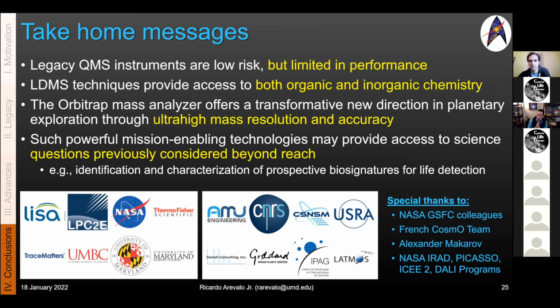The second one is, is the Orbitrap just like the commercial one? Yeah, I'm specifically interested because I've seen some flight instruments that have a very slightly different geometry than something you would expect to use in a lab here. And I've just been curious about that.